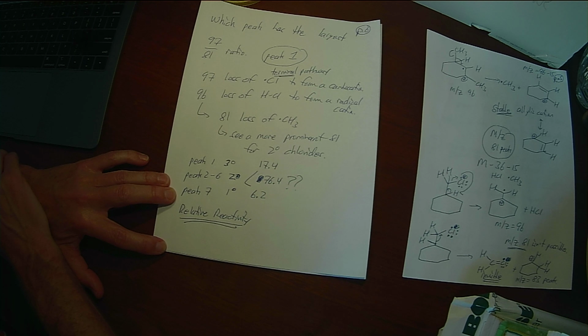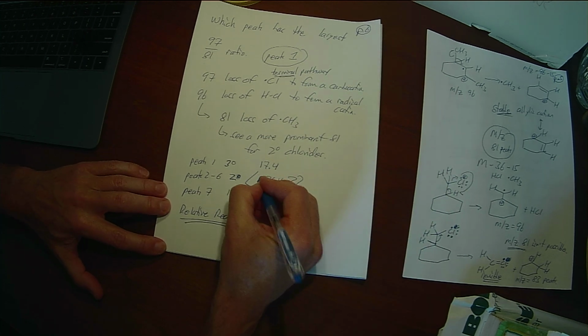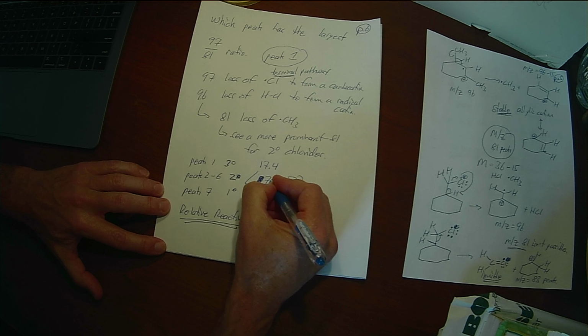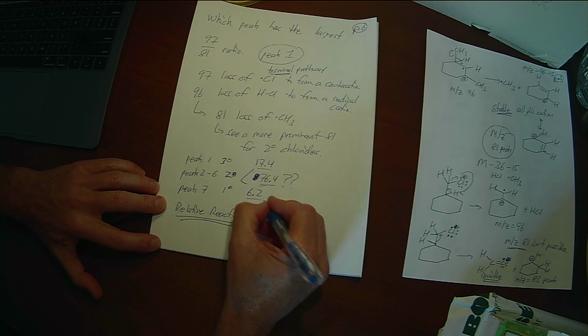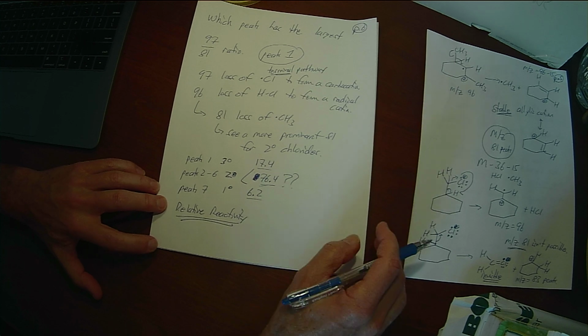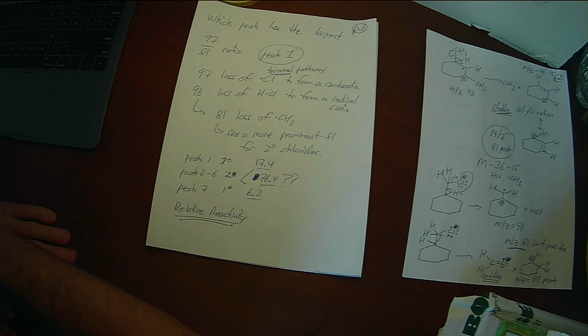Is that what you got, Emma? I had a question about whether we should consolidate all the area percents for the secondary. Yes, you should. There's no reason not to, because you don't know which one's which for the other ones.